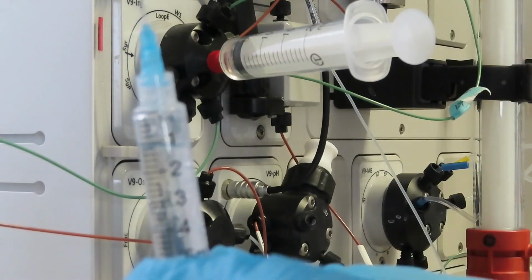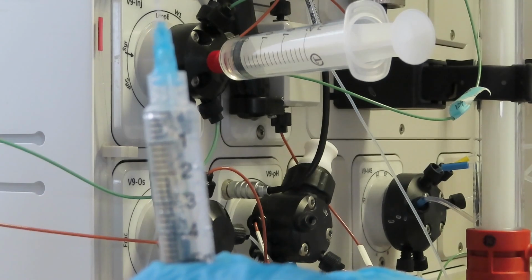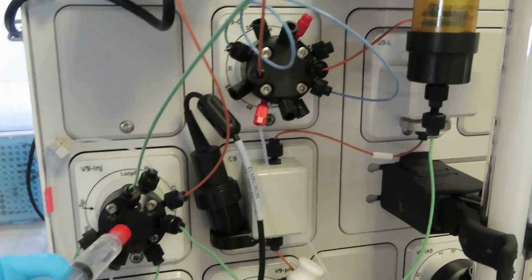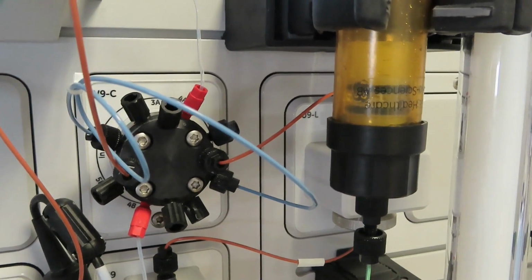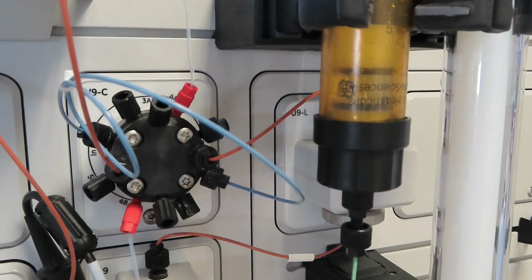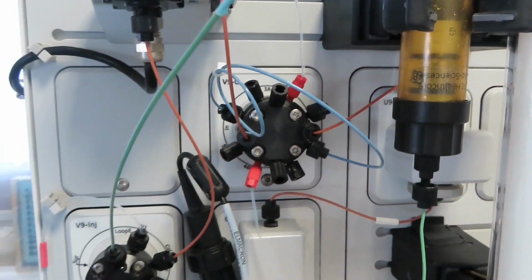Once the ethanol has been removed from the system and the column has been equilibrated with the running buffer, which is the same as the dialysis one, the concentrated sample must be loaded into the injection system. It's very important, again, to avoid the entrance of air in the column. In this particular column, the maximum sample volume allowed is 5 milliliters. It's important not to exceed this volume to avoid an excessive dilution of the obtained samples.